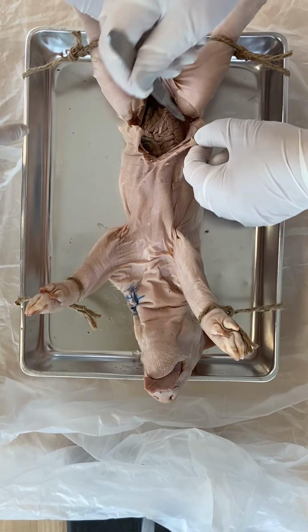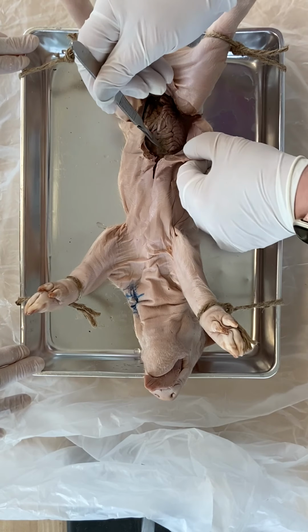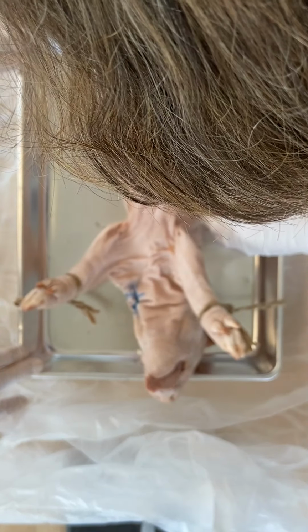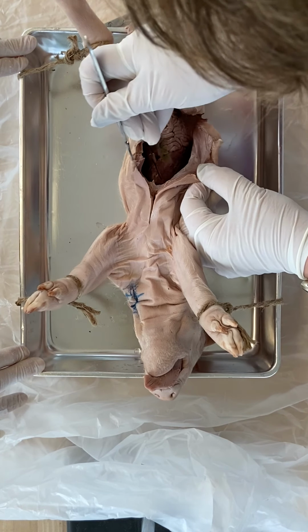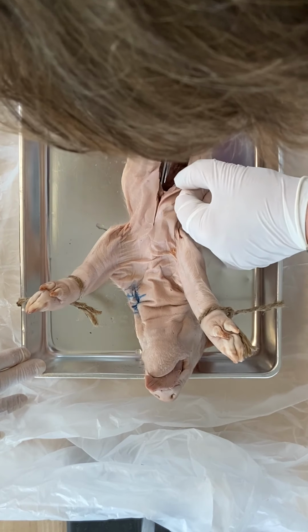There we go. All right. Should we do it? We might as well cut while we're here, yes? Yes. All right. We'll try not to slice through too much diaphragm. There it is. I guess it's inevitable, isn't it? It is. If I can get it just at one side intact. Gosh, how much harder than the fresh one. And he is bigger, too.